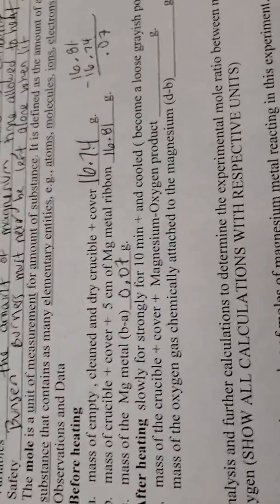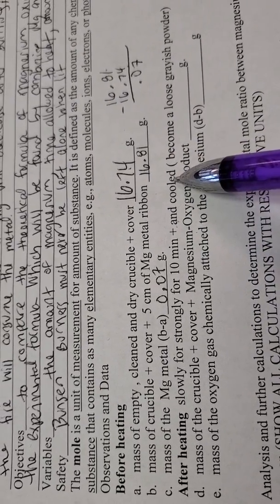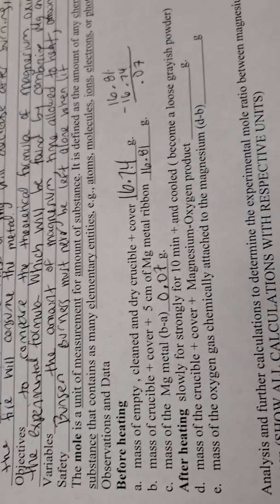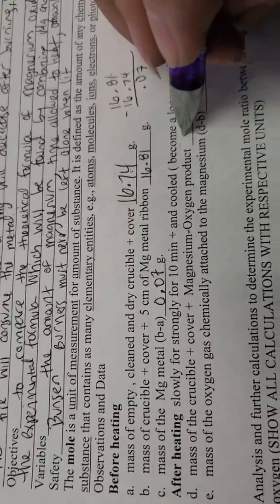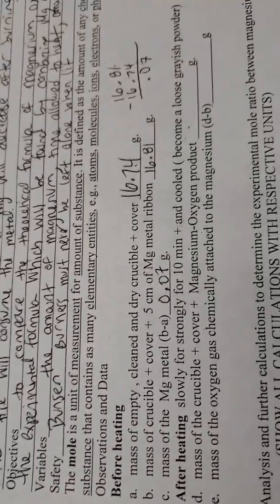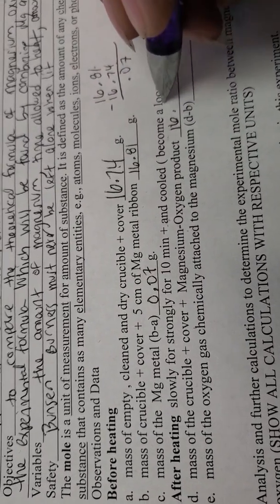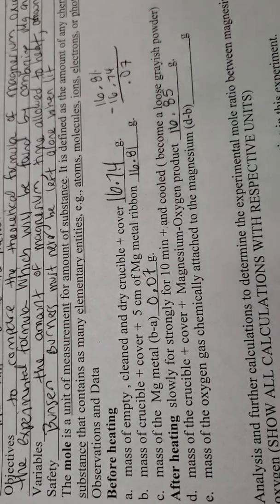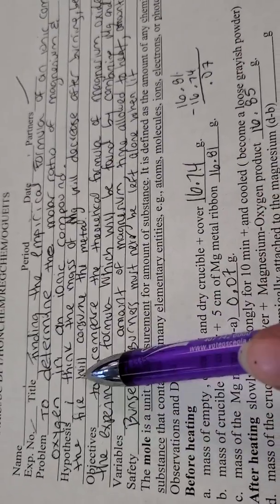All right, the next part says I'm going to heat it for 10 minutes and then I'm going to allow it to cool. It should look like a gray powder after. Again, it should kind of look something like that ash right there. All right, so if I did that, I would end up getting a number. I would put the ash, all of that, on a scale and I'd get the mass. And I did that and I got 16.85 grams.